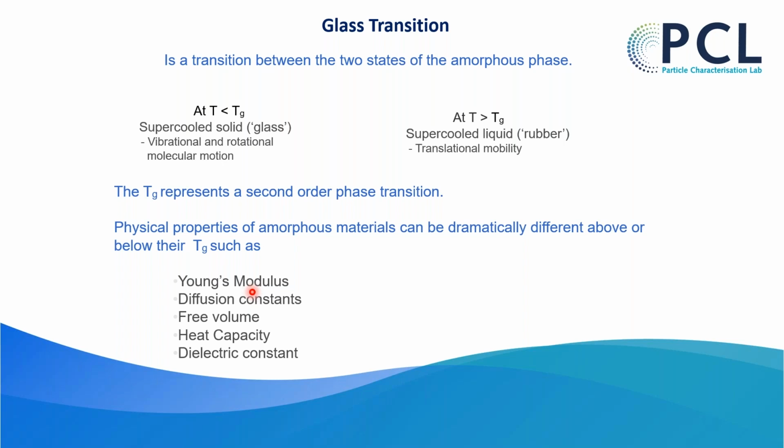Mechanical techniques can be a bit more difficult to employ, but are very, very sensitive. It turns out also that you can actually measure Tgs using DVS, particularly for materials that are hygroscopic and amorphous. And we'll see that coming up soon.